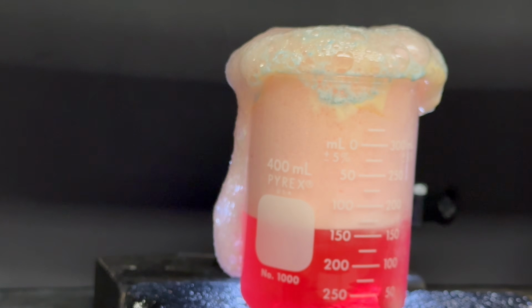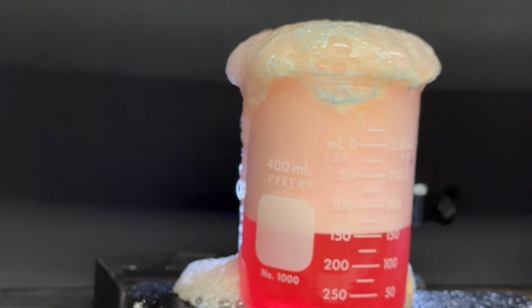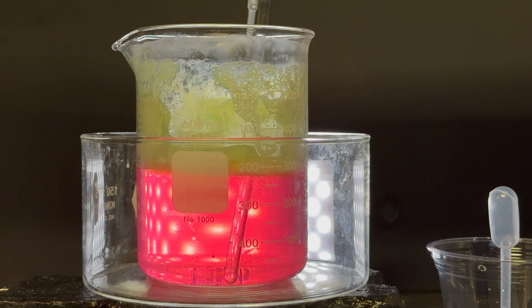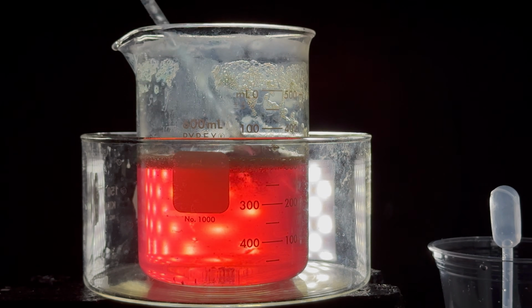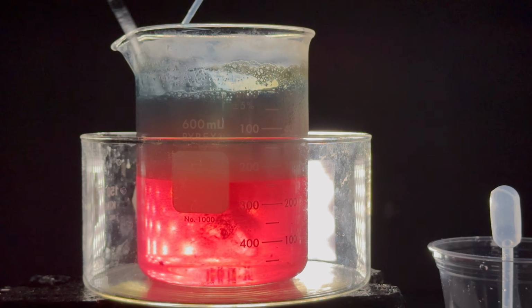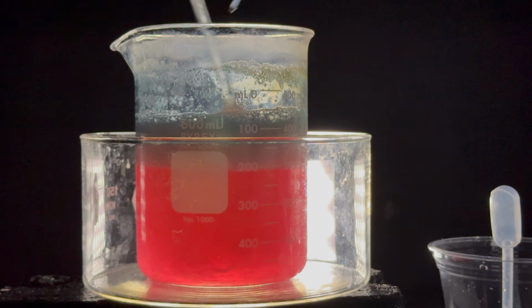In fact, here's a failed first attempt I made on one of the teeth, in which the froth overflowed the beaker. I wondered if I could get the froth to dissipate by squirting in a little bit of ethanol. And sure enough, it collapsed the froth like magic. This went on for over half an hour, adding carbonate to neutralize the acid, followed by ethanol to keep the foam at bay. And then at one point, I noticed something really interesting.